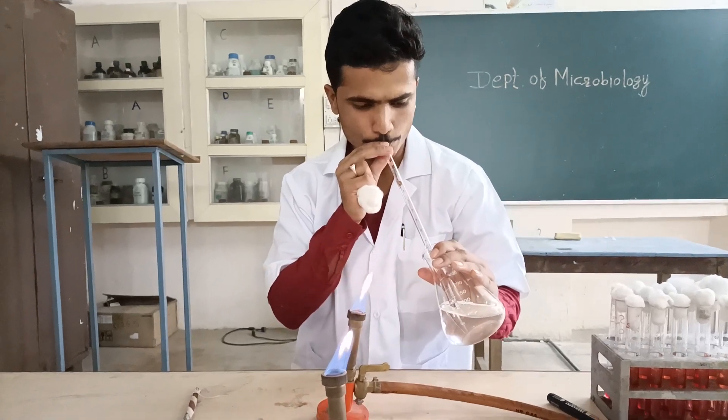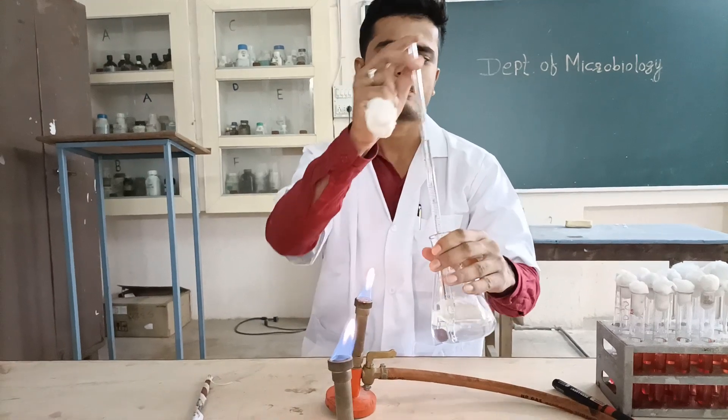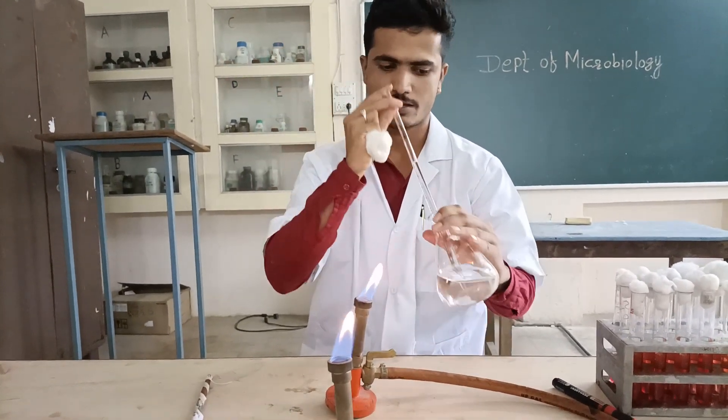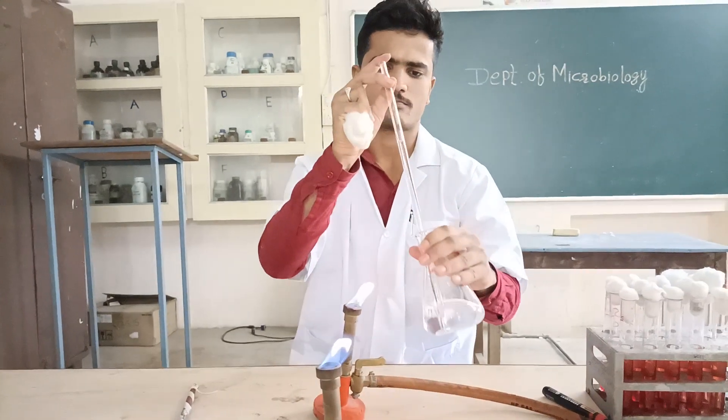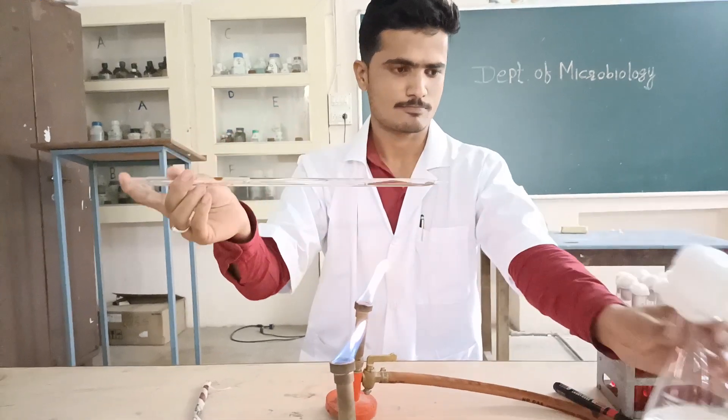We will take the given water sample to check its quality. The water sample is taken with the help of a sterile pipette.